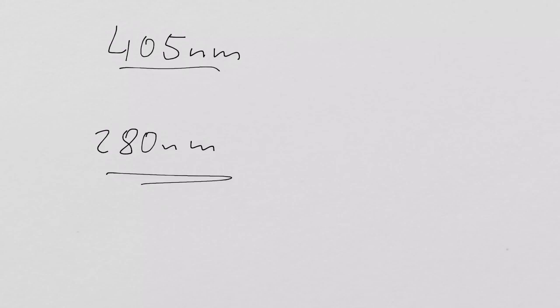And the other one was done at 280 nanometers. Now we know why we did 280 nanometers: you measured a protein concentration, and that is where it absorbed. Paranitrophenol absorbed at 405, but you used two different cuvettes. Why?